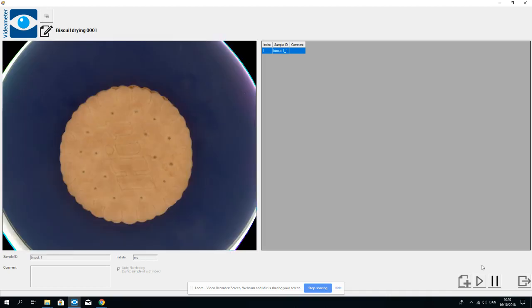And if I let it continue, it will capture another image in five minutes and another in five minutes again until it have been acquiring for two hours and it will leave 24 images in my folder.